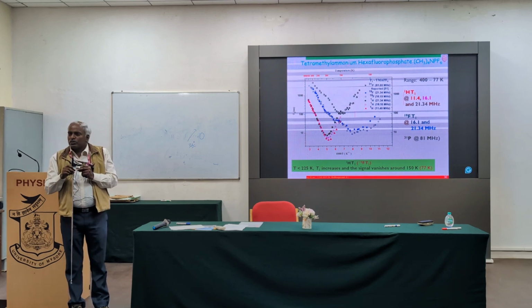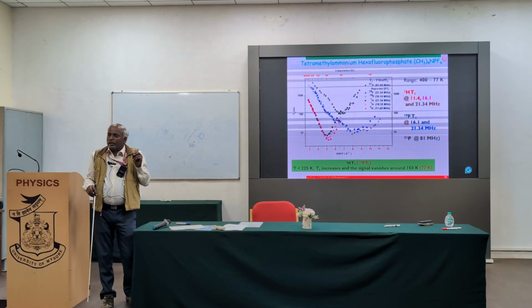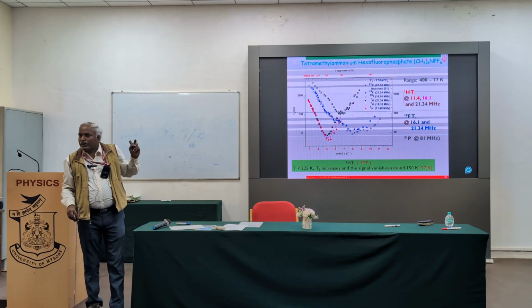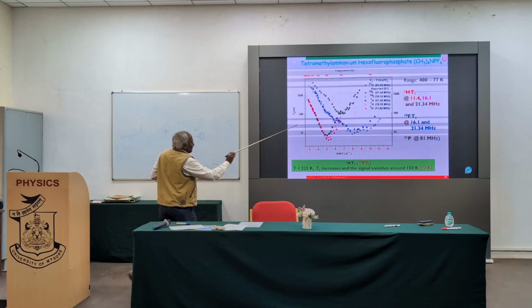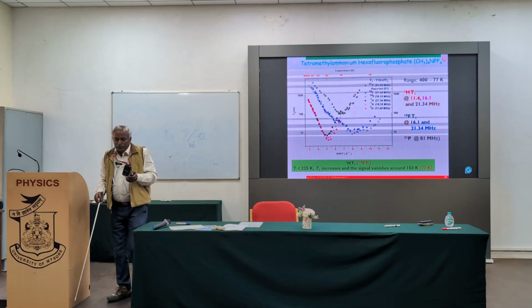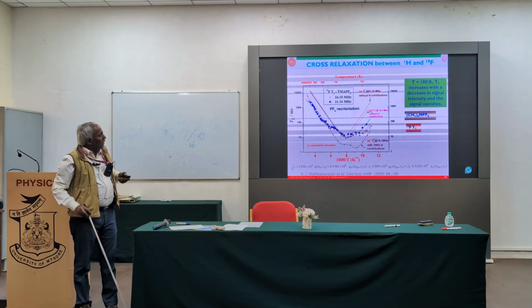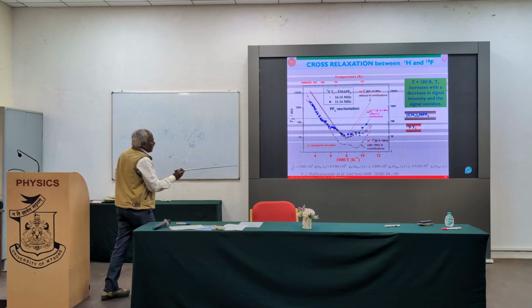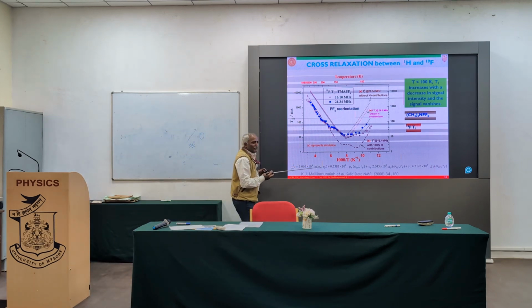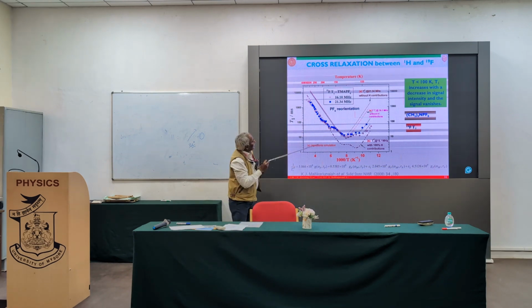I never did a Fourier transform for this afternoon data, only for the morning biomolecules I applied the Fourier transform. Here it was not required. Like that, I can always extract different ranges, I can identify different motions associated with that, and just to show you, to scale your equation, this kind of lengthy equation I have to write to fit this kind of data.